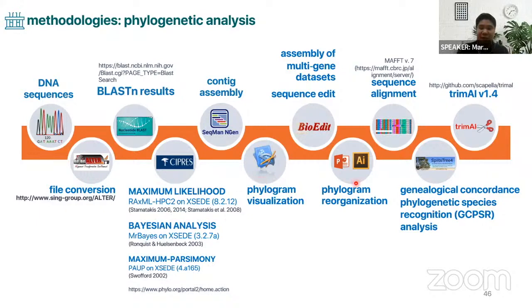And you will visualize and revise. You do not revise the whole tree, but you only revise the names. Sometimes when you do analysis, you have the code, right? So the correct name of the fungi. And you do further analysis to determine if it's new or not.